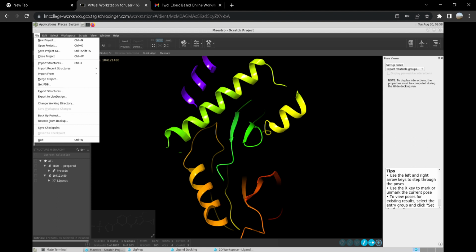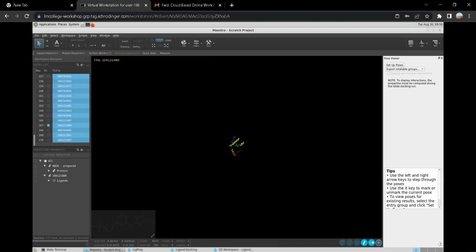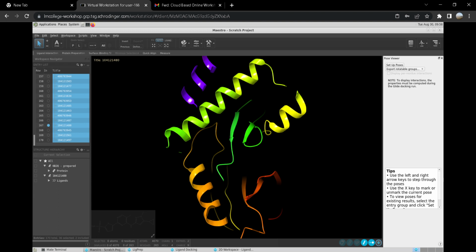We docked it. So we have a very recent tool which is quite handy to be used, and that is called Ligand Designer. So I think I can call upon Dr. Kaushik if all of you don't have any questions with the current discussions.